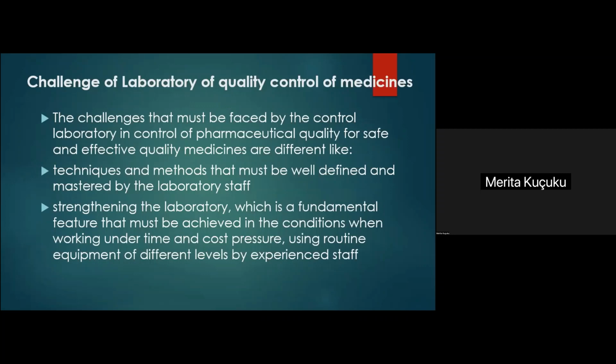What is the challenge of the laboratory for quality control of medicine? The first challenge that must be faced by the control laboratory in controlling pharmaceutical quality for safe and effective medicines is that techniques and methods must be well defined and mastered by the laboratory staff, and this will be the last word of science.